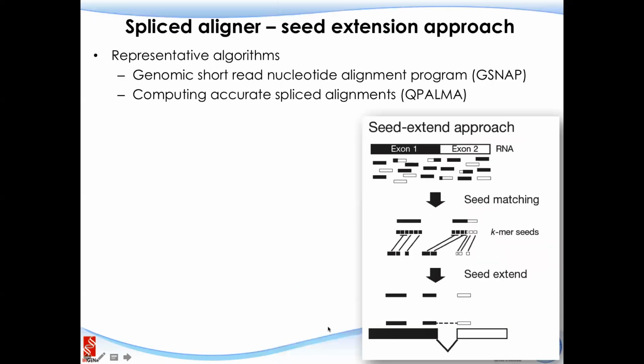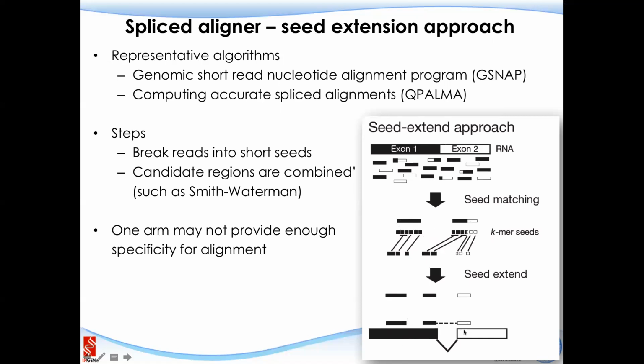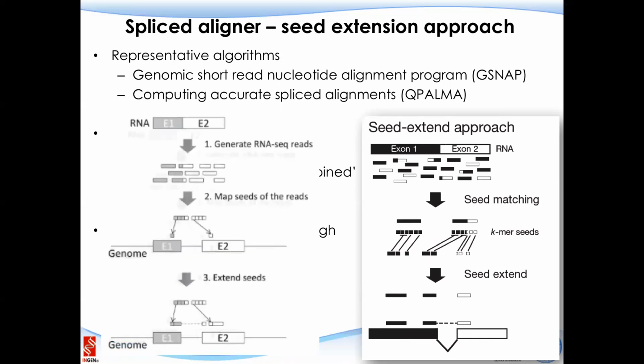And the second one is, as I mentioned, the seed-extender approach. We split the read into k-mers, and the k-mers can help us seed or anchor a certain part of the read, maybe the whole read, to an exon. If the read spans a splicing junction, it can also help us anchor the second part of the read to the other exon. I have one slide about the STAR pipeline in the first lecture, but that one will not be included in the final exam. So you just need to get the key idea about this, and keep it in mind.